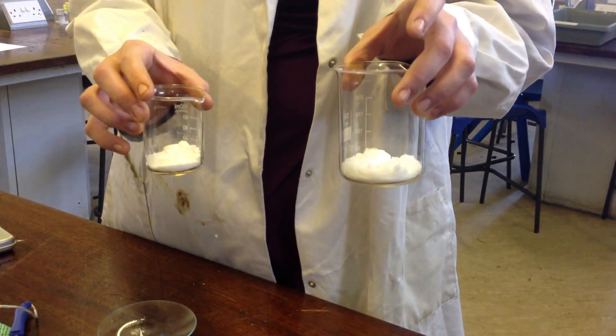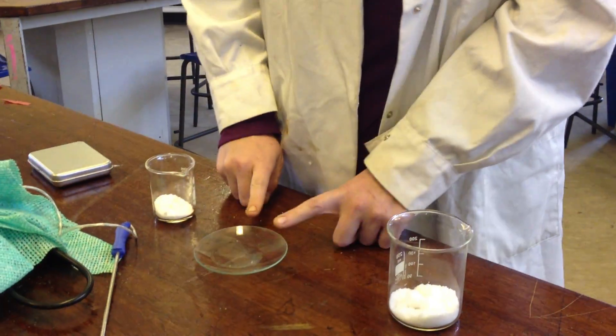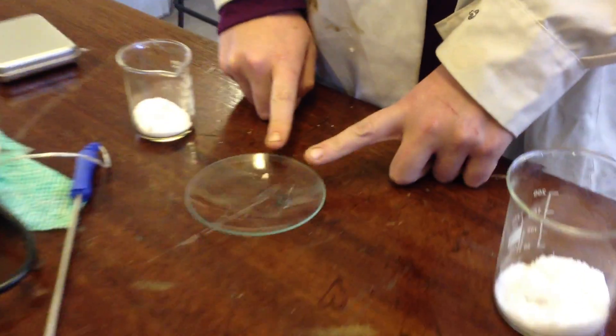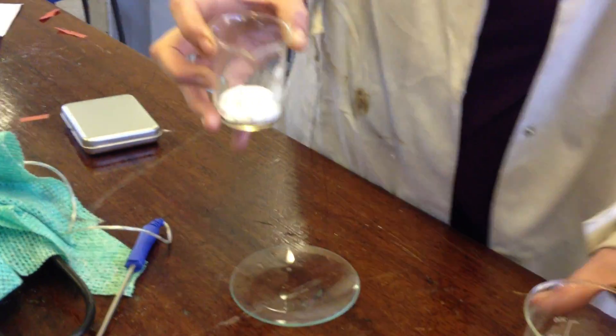In here we've got some barium hydroxide and ammonium chloride, both solids, as you can see. I have a watch glass with some water on it and a temperature probe, and we're going to react them together and see what happens.